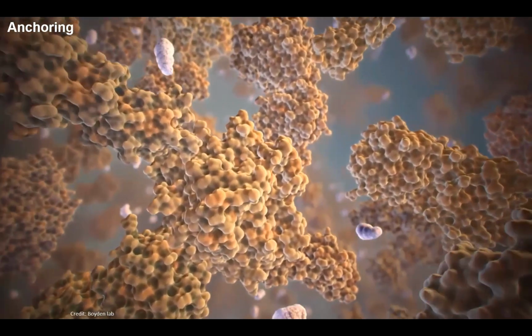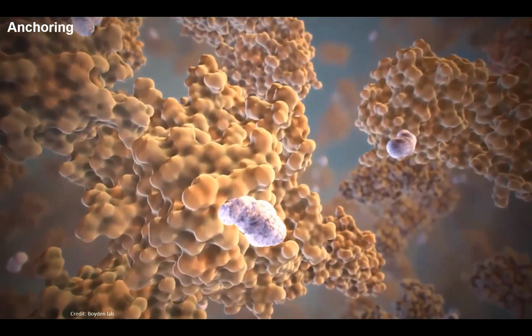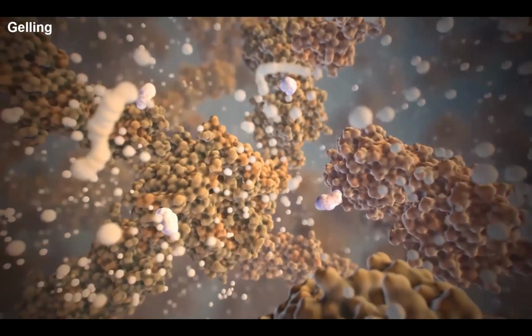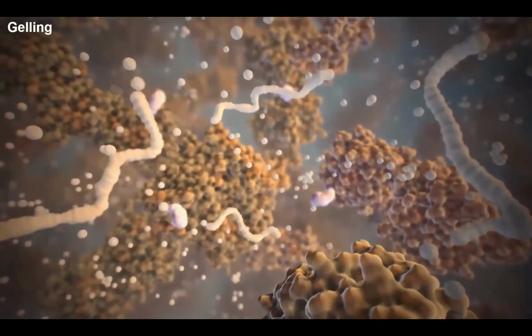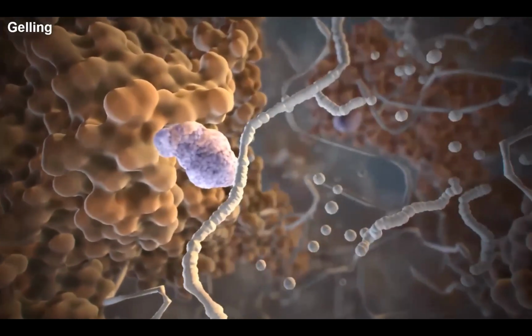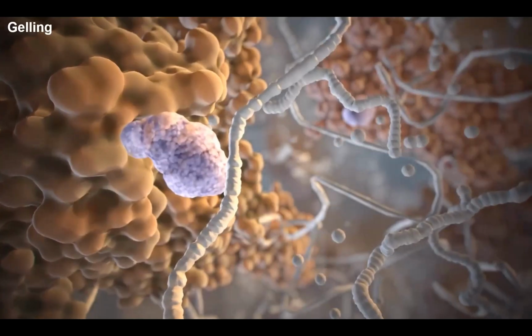So first, we apply small chemicals to modify the tissue biomolecules. These are like chemical handles that allow these biomolecules to form covalent bonds with the monomers that we use to synthesize the hydrogel network within the tissue. As you can see, these small little balls are the monomers, and they are forming this gigantic hydrogel polymer network. And during this process, the modified tissue molecules are now connected to the network.